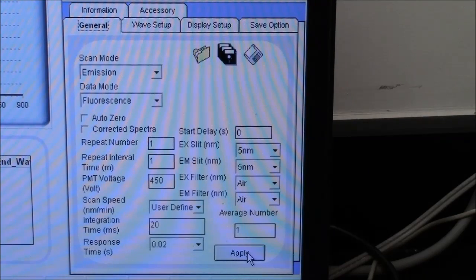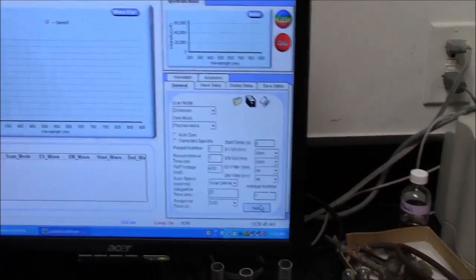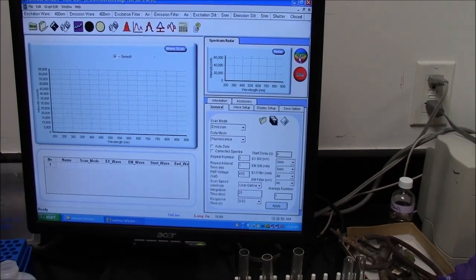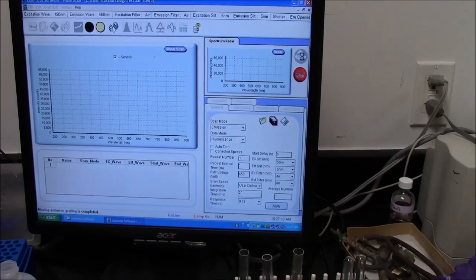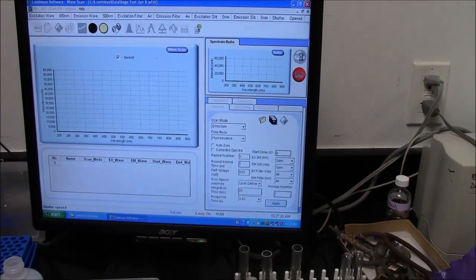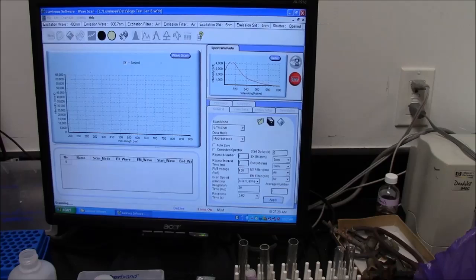Alright, that looks okay. So now to actually collect a spectrum, up here is a button that says start and stop. And this will be a mini graph of wavelength versus intensity, and I will click on start. So there you can see it's collecting data, and it does so very quickly. It takes a little while for it to get started, but once it starts, it's very quick at acquiring data.